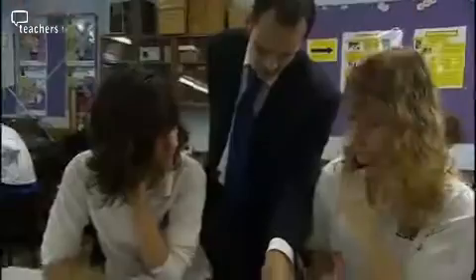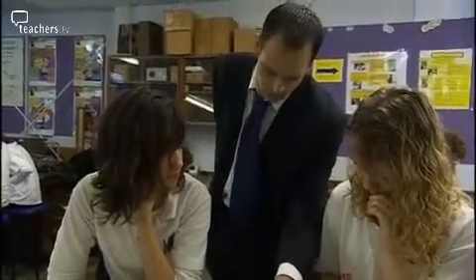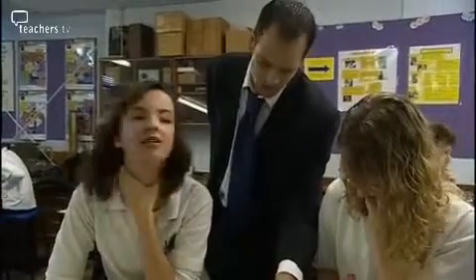So what can you say about the number of H pluses and OHs here? They're equal. Why? How do you know that? What evidence have you got? Because it's neutral. pH 7. Good. Right.